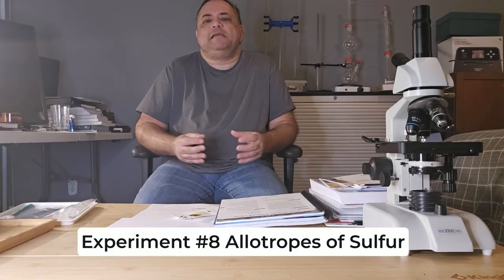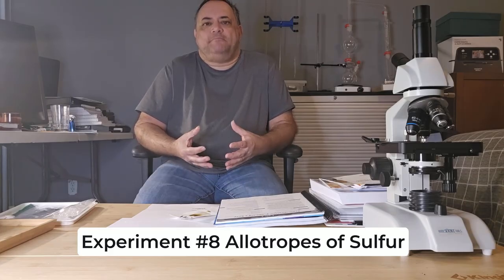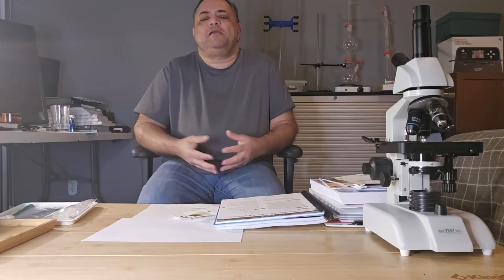Hello everybody, welcome to Science Abounds, Science at Home. In today's experiment, we're going to be looking at the allotropes of sulfur. And we're going to be taking the lab outside to perform the experiments, mainly because of the toxic fumes and smells of sulfur when you heat it. And just for safety reasons, you really don't want to be heating sulfur inside your home.